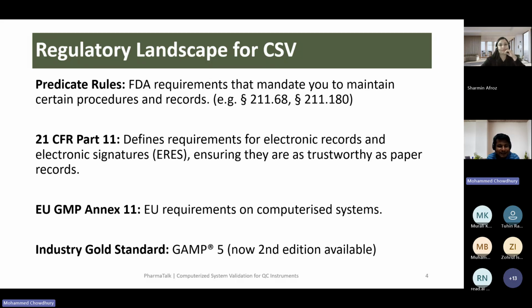But what I see, things are not like that, because the fundamental guideline for computer system validation, the General Principles of Software Validation, which was published in 2002, already mentions everything in the CSA guidelines, like this risk-based approach and least burdensome approach. All things are available in CSV, I mean, the General Principles of Software Validation.